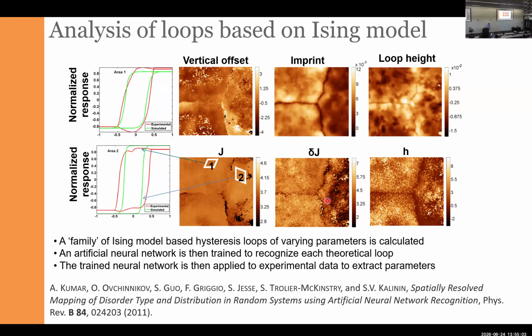A very important thing for any type of machine learning analysis is to explore how sensitive your analysis is to small changes in the way the data was curated. Physics-based models usually incorporate any type of curation as part of their structural expression.